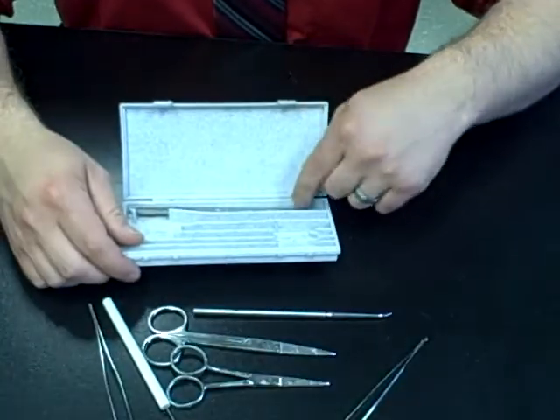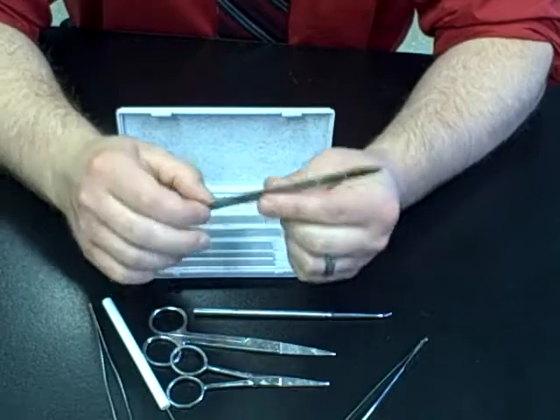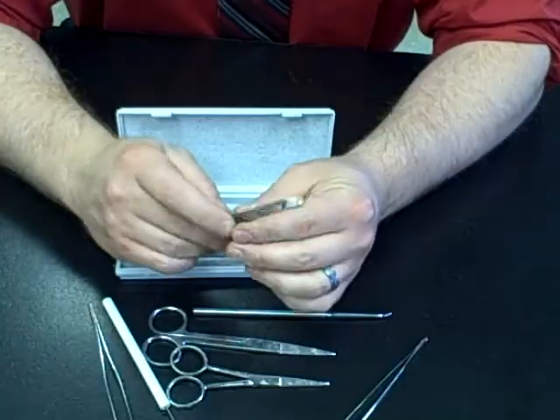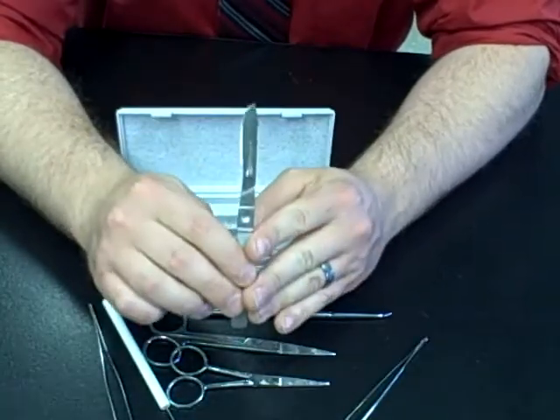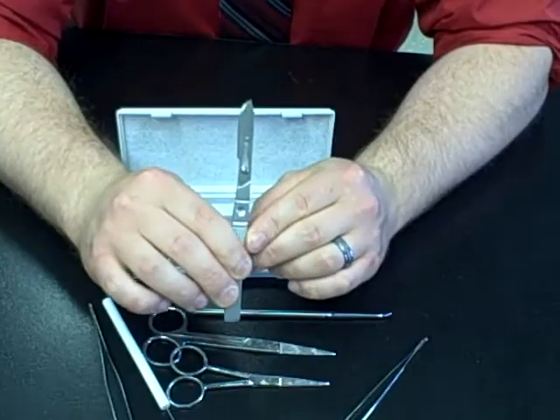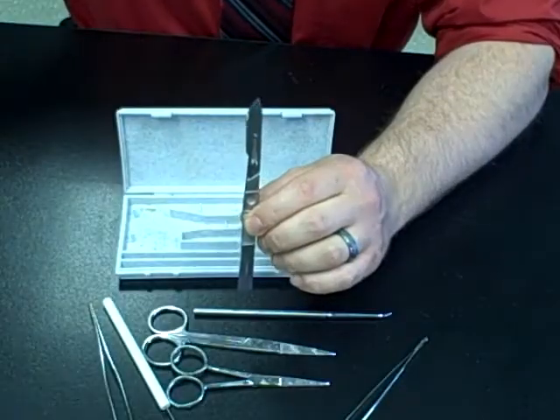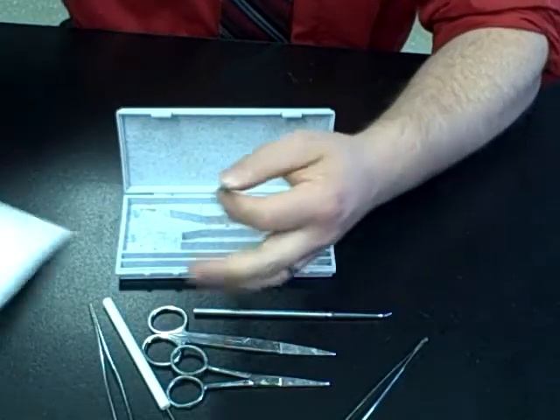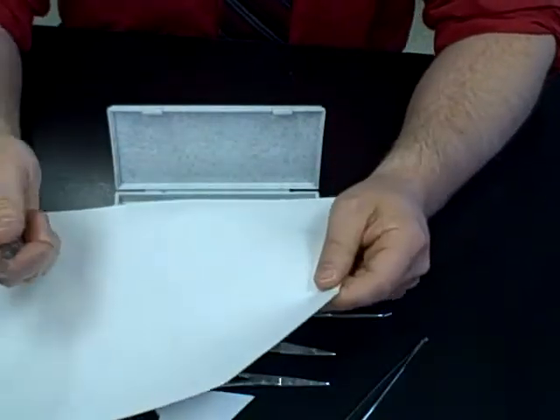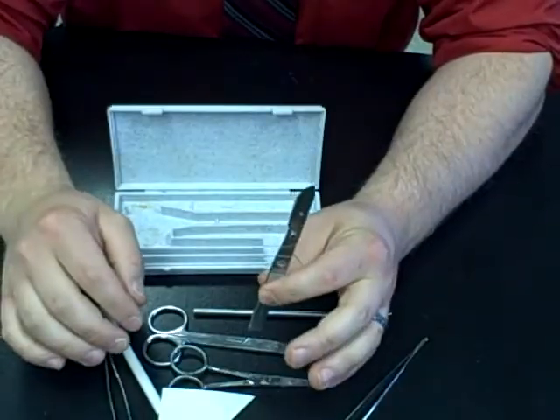The final thing, which everyone's always most excited about, is the scalpel. You won't actually see one of these in your dissection kit until our last dissection when we get to the rat. These are extremely sharp — as you can probably see in the video, they have replaceable blades, and for each dissection you get a brand new blade. Just to give you an idea, we have a piece of paper here and we will easily slice right through it. These are extremely sharp instruments.